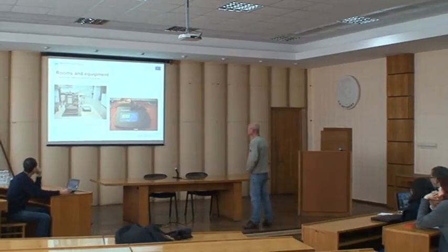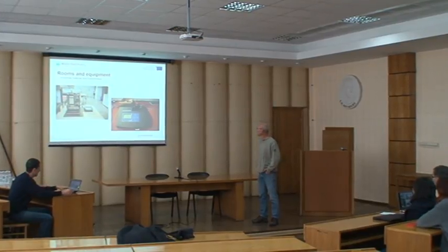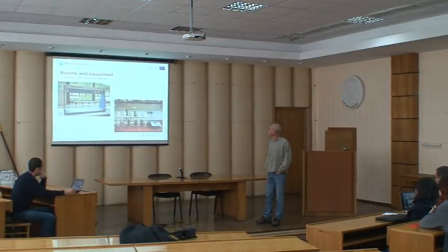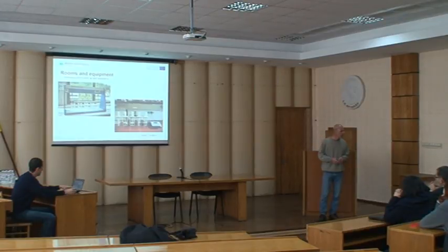Okay. Here you can see the analytical balances and turbidimeter we are using for the lab training as well. And these are stationary and mobile jar test equipments. You might know this. This is very famous on the right-hand side. It's from Scandinavia, so you can put it in a suitcase and do some experiments at customers' space or wherever.